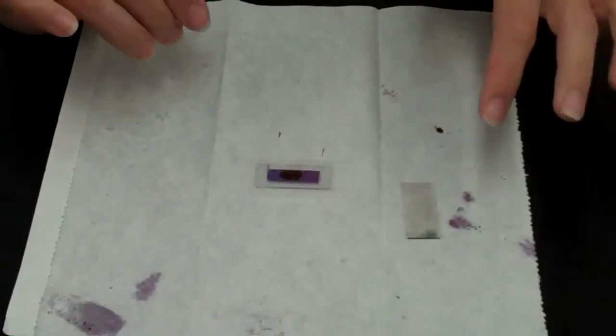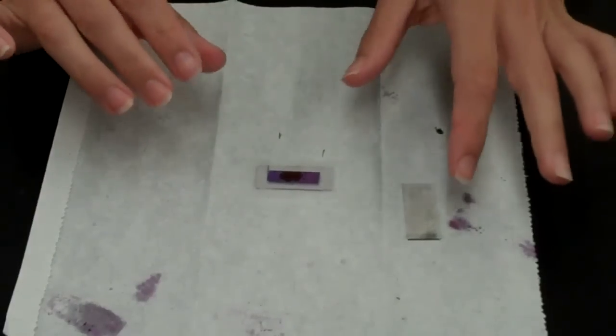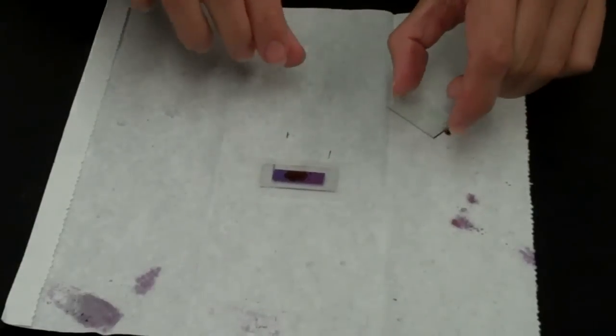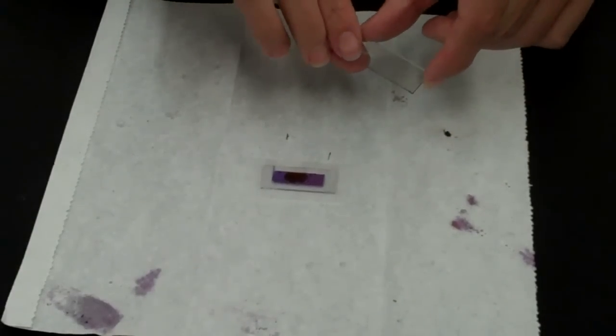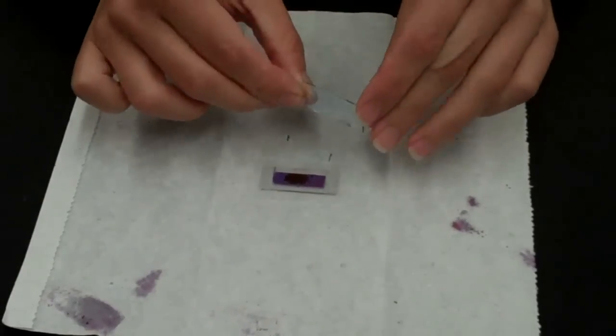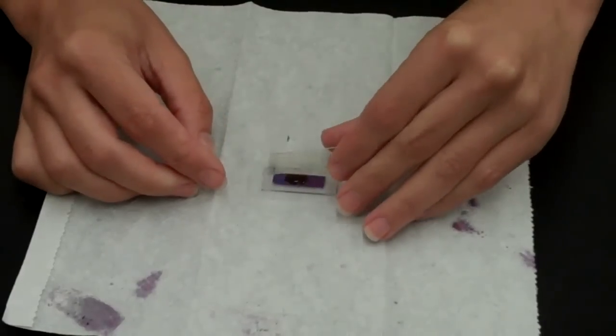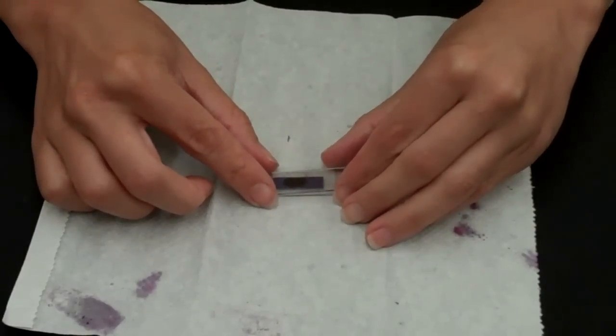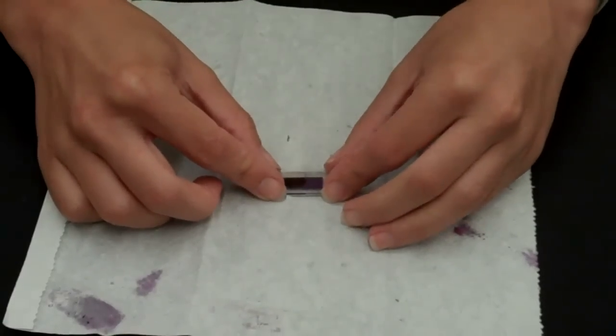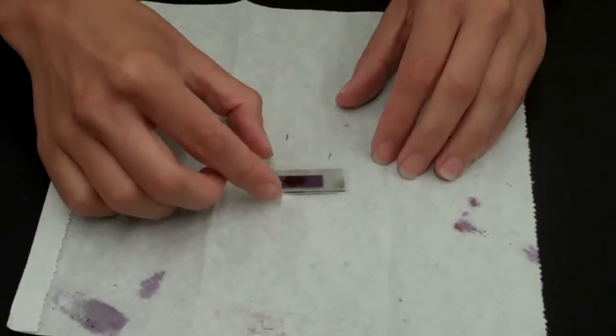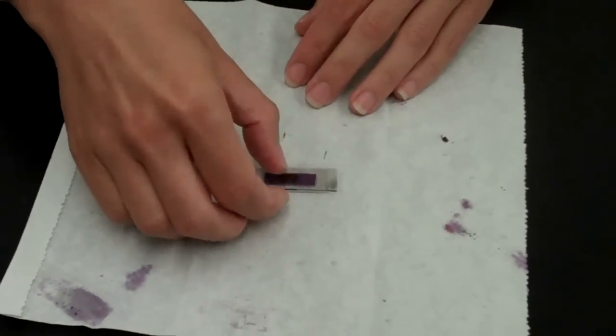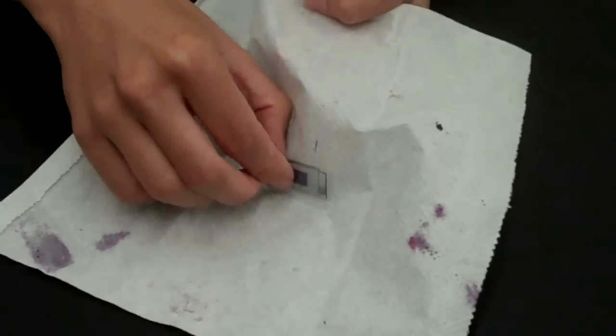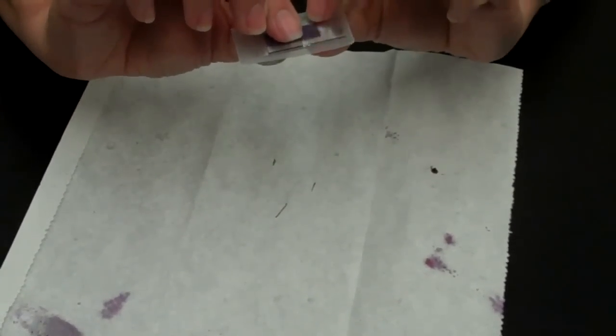At this point, you're now ready to assemble the solar cell. You will pick up the transparent indium tin oxide coated slide with the carbon coating and put it face down onto the titanium dioxide dyed slide. And at this point, the easiest way to remove it from the paper towel is to slide your hand under the paper towel and pick it up like that.